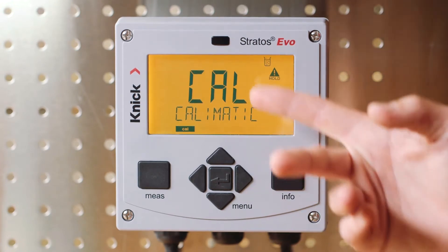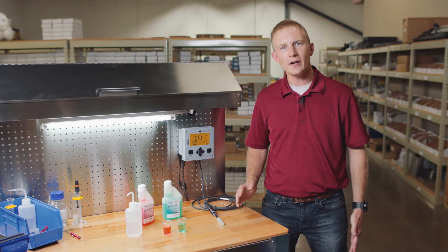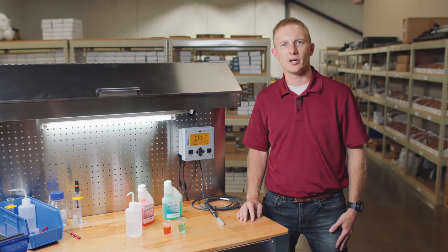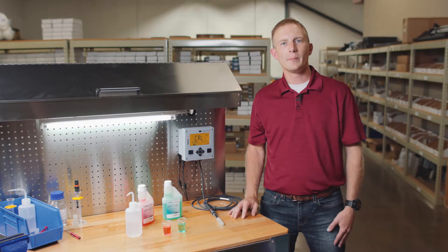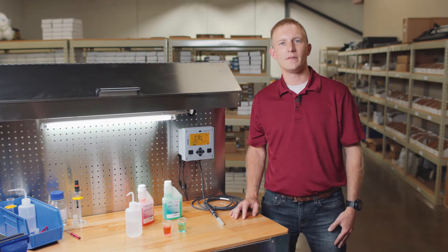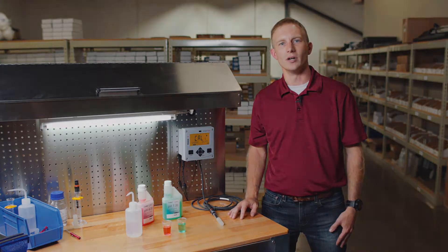Since we're performing an automatic calibration, it's very important that the proper buffer sets are selected when configuring the transmitter. Automatic calibration ensures that the buffer sets are temperature compensated and are automatically recognized during the process. If you're unfamiliar on where to make the selection of the proper buffer set, please be sure to view our setup and configuration video on the Stratasevo.